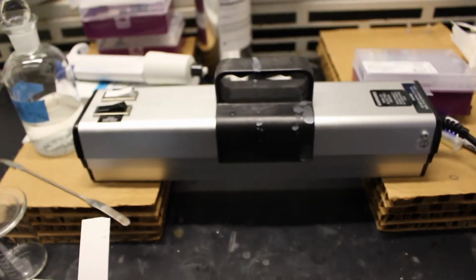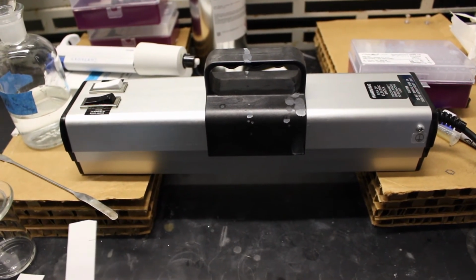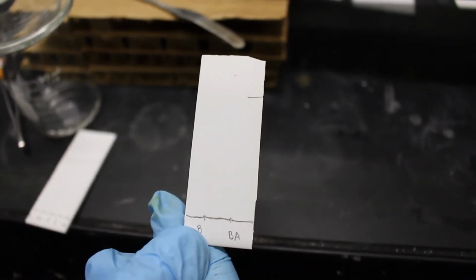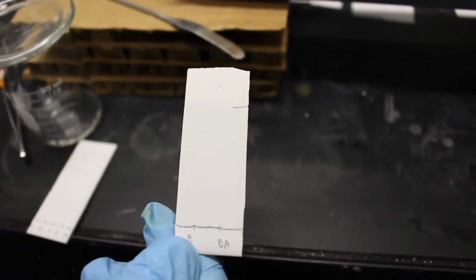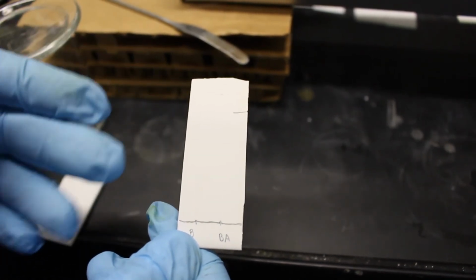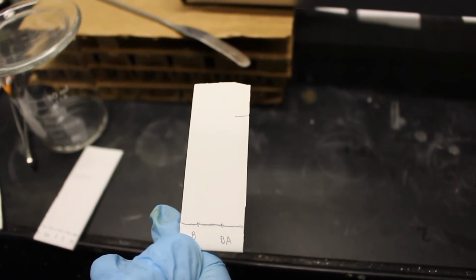and the UV lamp will emit UV light at 254 nanometers, and basically these plates are coated in a phosphorescent material that will appear green. But if there is an organic compound that absorbs UV light, then it will block the green from showing. So it kind of looks like purple spots on a green background, and that'll tell us where the organic spots are located. So to do this, we can turn off the light.